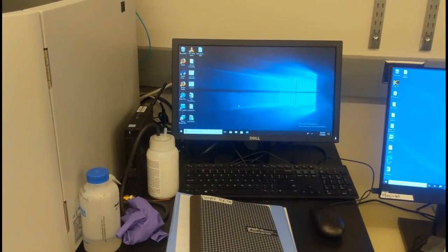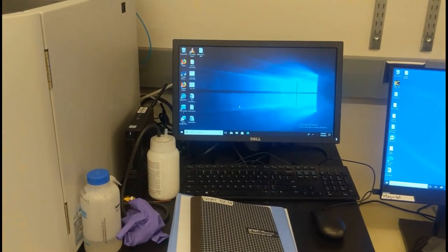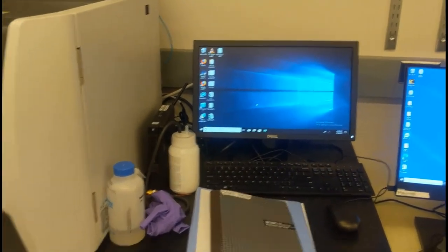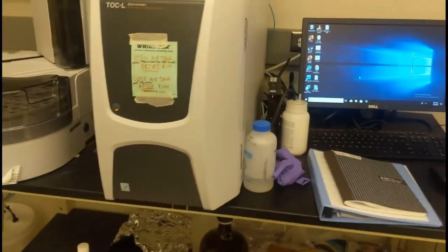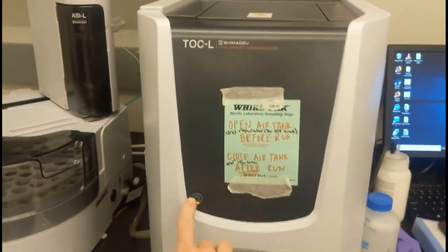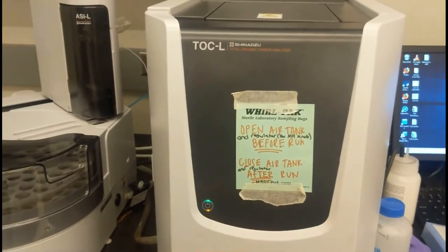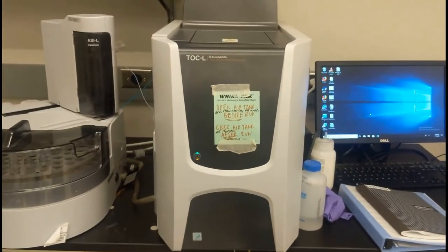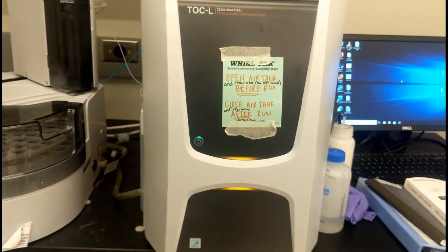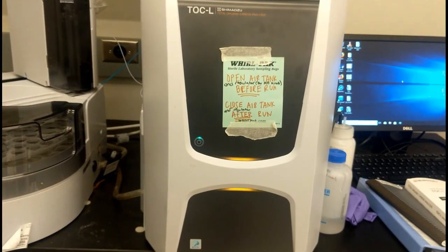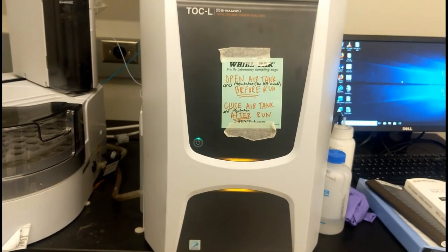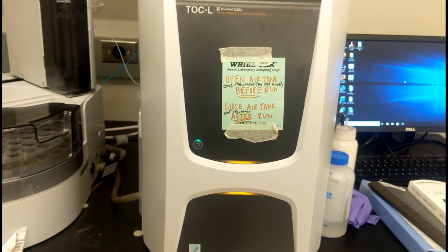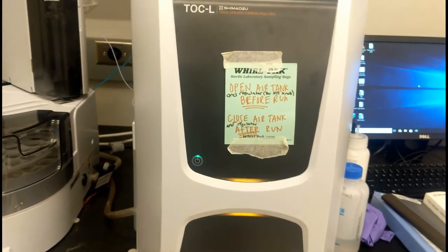The next thing you need to do is log onto the computer. To turn on the TOC, just push this button right here in the front. It's going to turn from orange to green, and you'll hear the instrument start to power up. Once we turn the TOC on, it's going to take a little while to warm up. While it warms up, we're going to check a few things to make sure that it's completely ready to go.